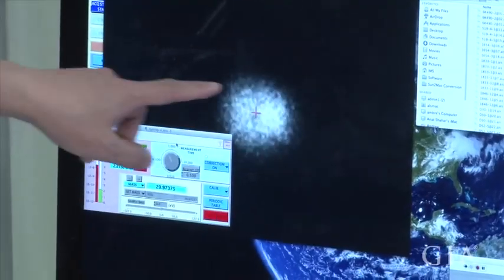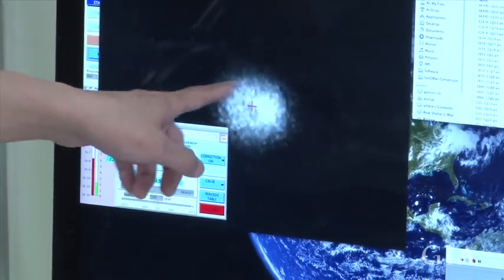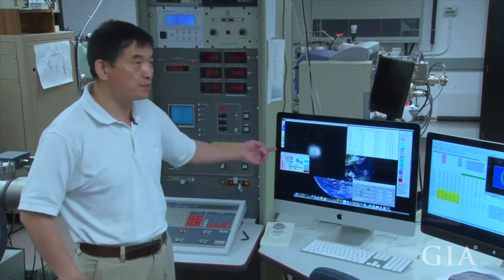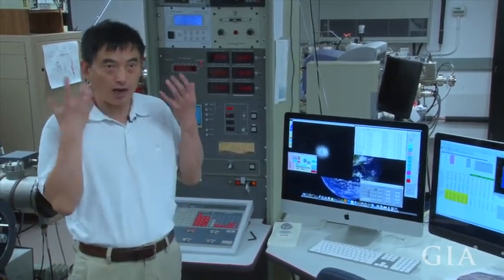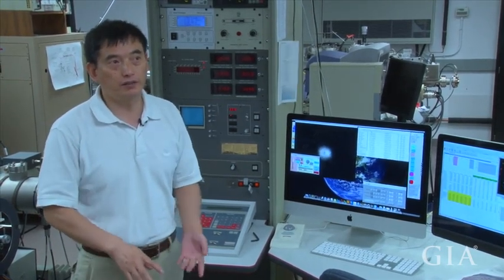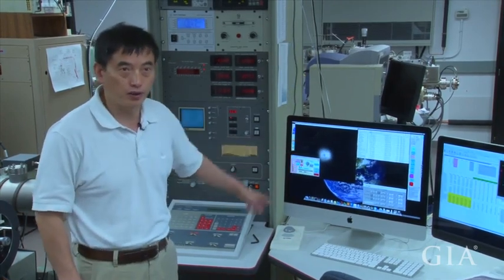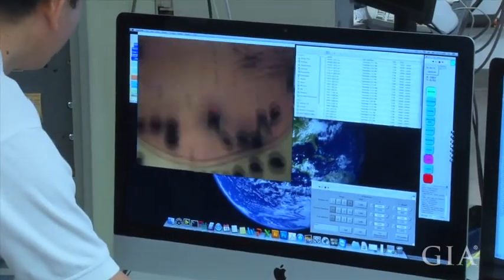This mode only shows where the ion beams are coming from the spot. You only detect any ions that's coming out from your target. You can measure a peak but that's not from this mode. The peak is measured using a program.